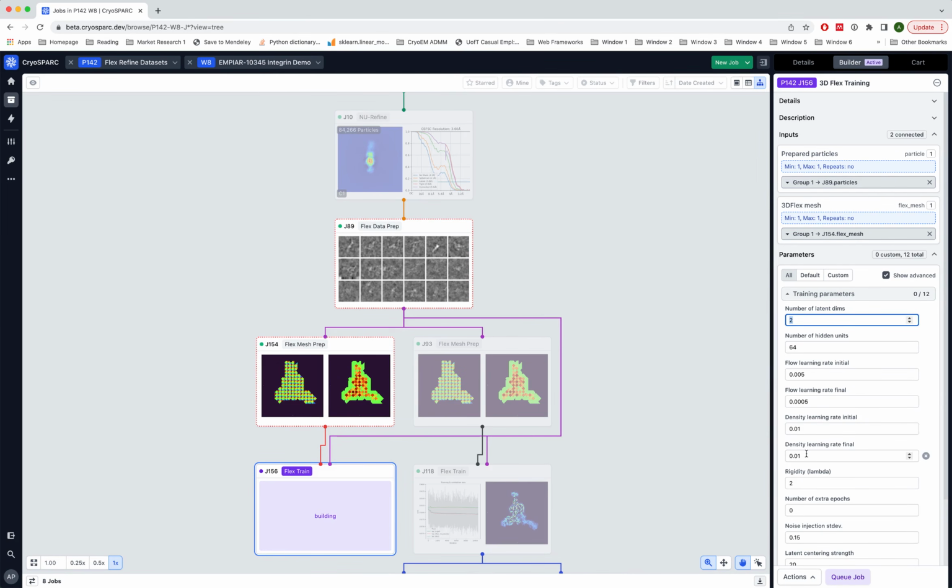The next 4 parameters are all learning rates, and I'll come back to talk about what these mean and why they matter. We spent a lot of time tweaking the technique so that these don't have to be changed much, or if ever. But in case you do need to change them, these can be changed, and I'll describe in what scenarios that might need to happen.